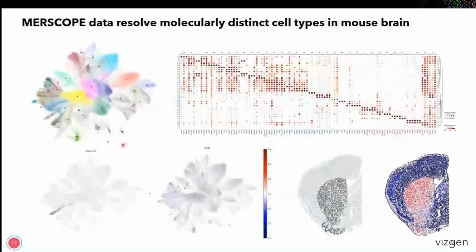So for downstream analysis, I combined all the cells from 17 samples, getting almost 1.8 million cells. The first round of cluster analysis revealed 34 cell clusters, which exhibit distinct gene expression patterns, as you can see here. By combining both gene expression and spatial information, it's relatively easy to annotate cell clusters.